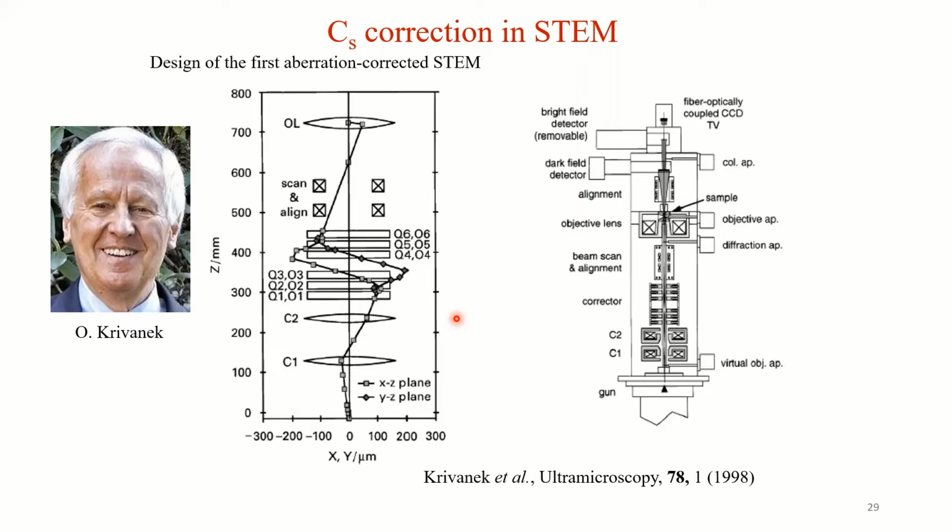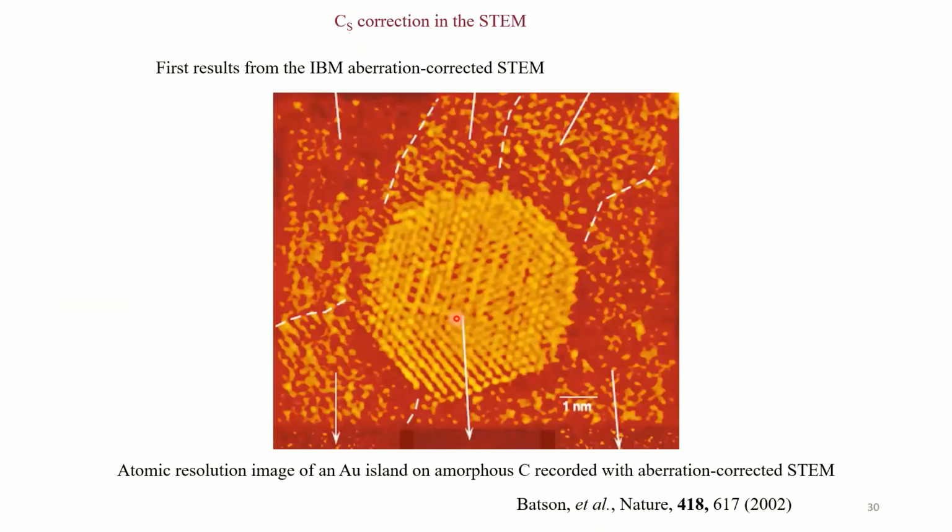Again, you pass it through a quadrupole to make it ellipsoidal in the direction orthogonal to the previous one. Then you correct C3 in that direction using another octupole. Then you recover the shape by passing it through another quadrupole. So basically you have 4 quadrupole and 3 octupole lenses. This is the basic principle.